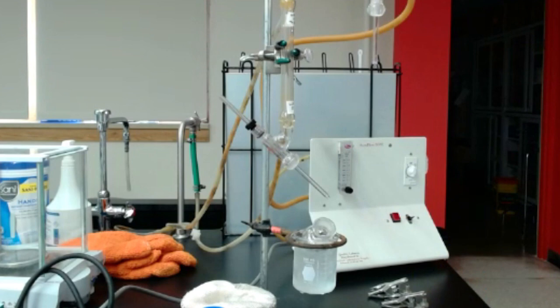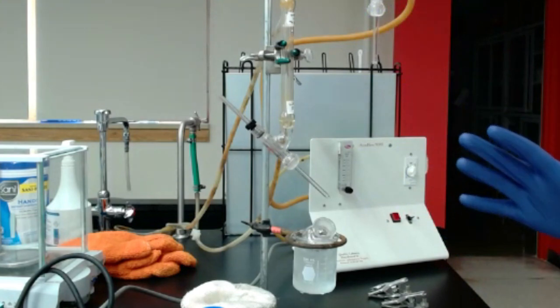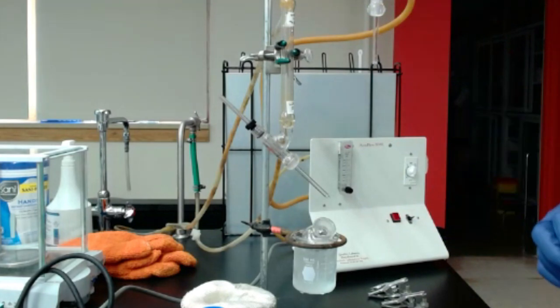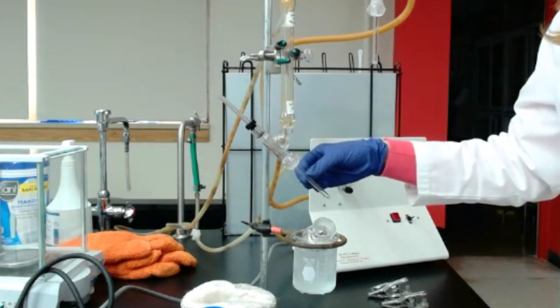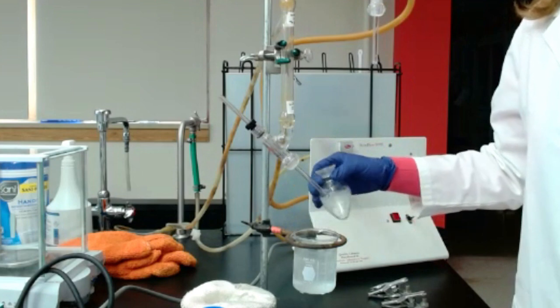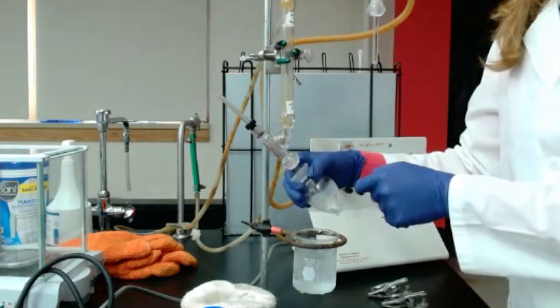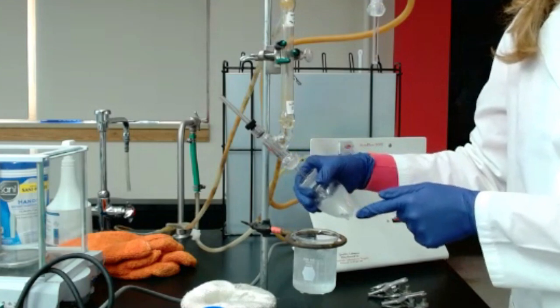All right, so now we're going to start with that system, AO for short. What you will need to have before starting anything. As I said, we're going to start by measuring free SO2. So you will need this system. It's composed of a glass pipette here. That's just to make sure air is going to go in, so you will have a flask that's going to be tight at the bottom. And that pipette is just to make sure air is going to make bubbles. You're going to have bubbles happening in that flask.